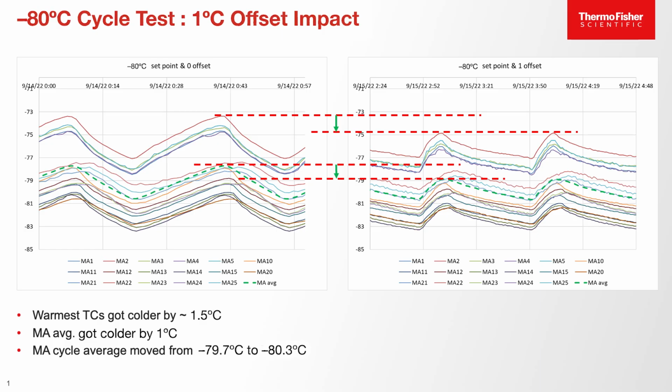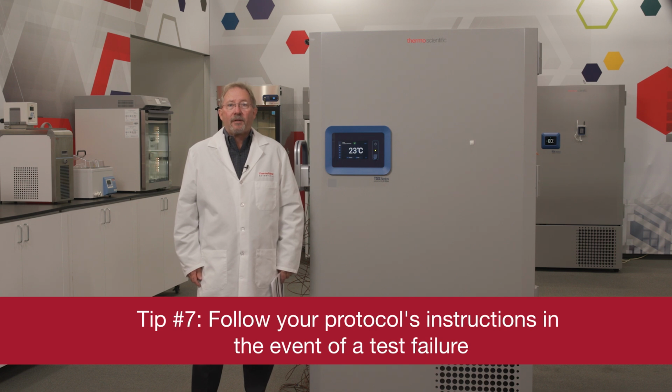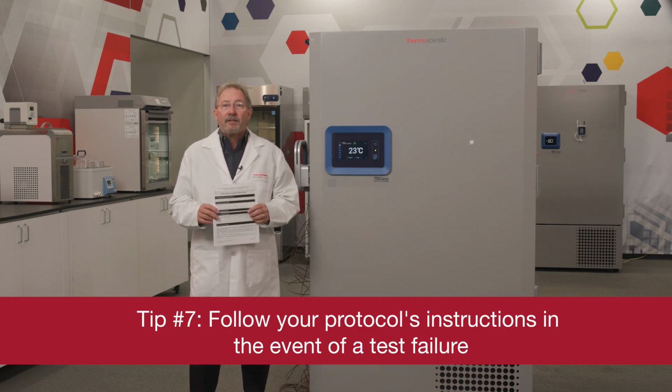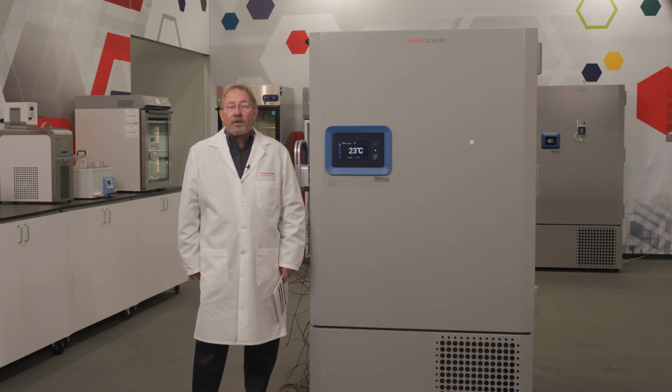Let's take a look at the trend on the left. The peak value is great, but it's not centered on the desired set point. The trend on the right has been centered. This allows for fewer nuisance alarms when opening the door to retrieve samples. On rare occasion, you may experience a test failure. Be sure that your protocol has specific instructions on what to do in these cases. Documentation is critical, as you will need to follow your instructions closely.